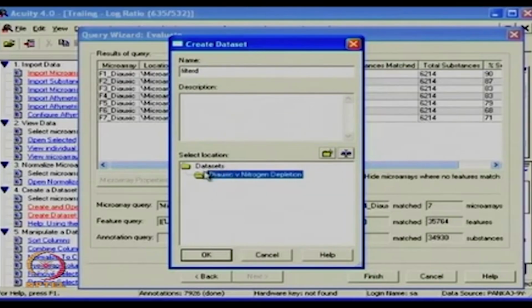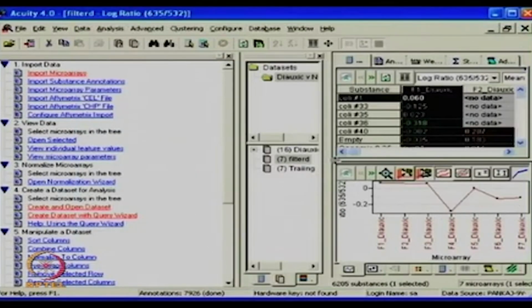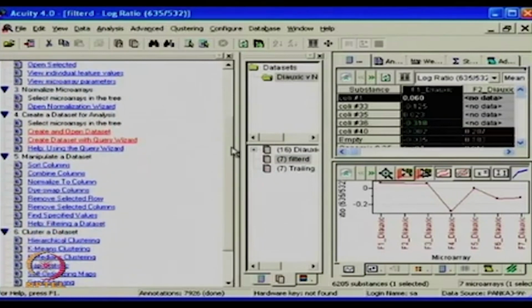So you cannot create files on the root directory, you need to create your folder and do the job. So it can do the job in this fashion. So once you are ready with your data set, what you want to do sometimes, based on your experiment, it gives you an opportunity for what all you can do.